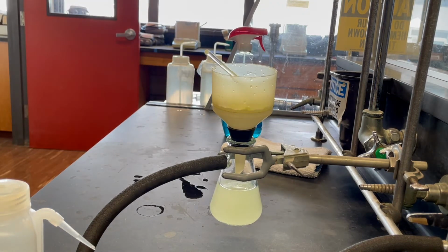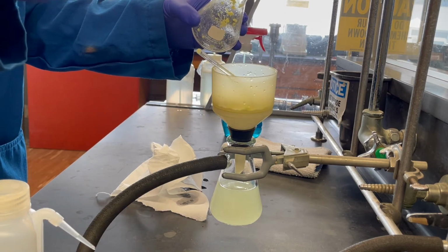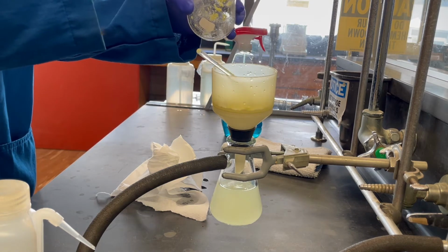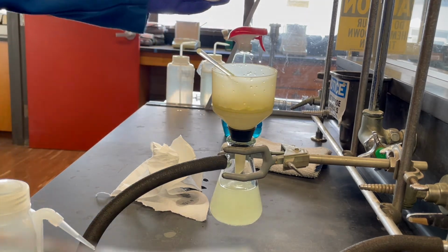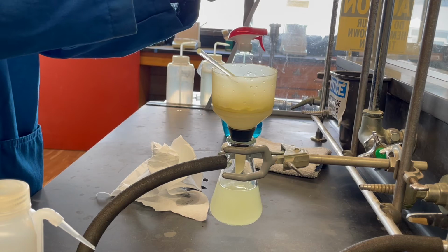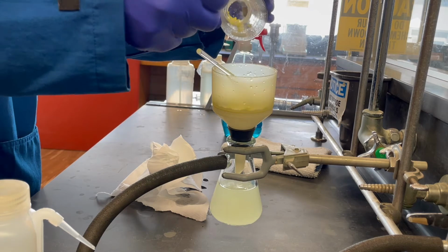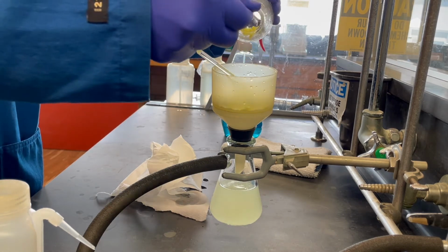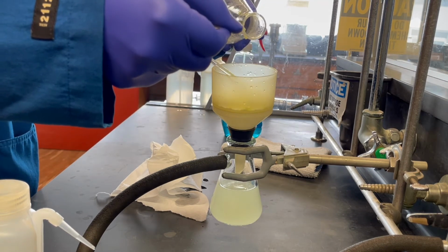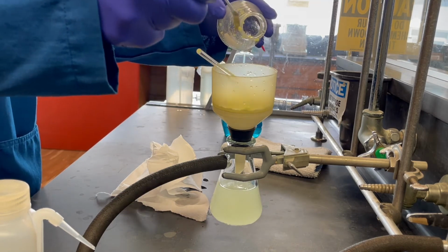Okay. I thought I'd tell you a little lab trick. This is actually more helpful for round bottom flasks because obviously they're round at the bottom. But you can bend, see this guy right here? Can you see that? Not really, but you know it's a spatula, right? You can actually bend them a little bit. So they're like this now. And it allows you to kind of scrape inside of here a little bit better. And that's lab tips and tricks 101. Anyway, we're still drying.